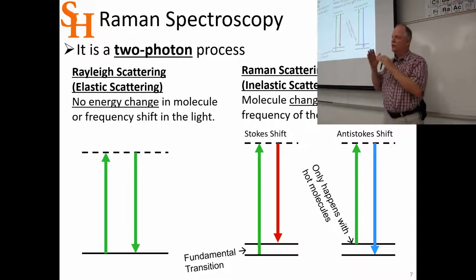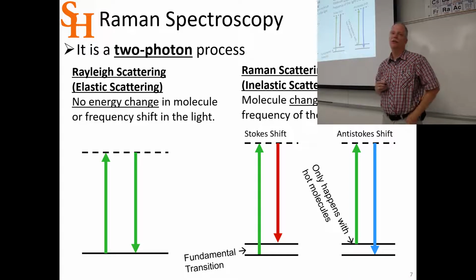And so it's that detuned tone, that beat pattern, that happens if it matches one of the vibrations in the molecule, then that shorter tone can be scattered off. And so then that photon is generated by this interaction.